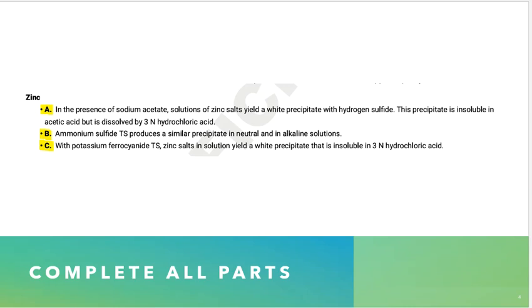So in normal circumstances, if we were measuring zinc, we would have to perform step A, step B, and step C. You do not get the choice of doing one or the other, or 2 out of the 3. You have to do all 3 that are listed before you can say, yes, zinc is present, because I completed the chemical version of the identification test. That is a have to.